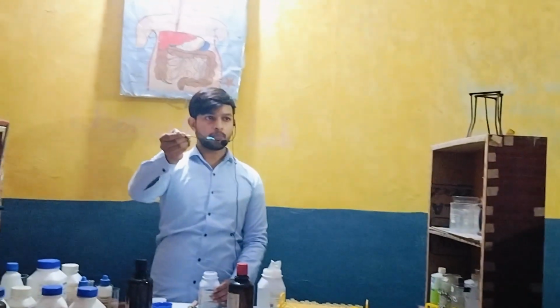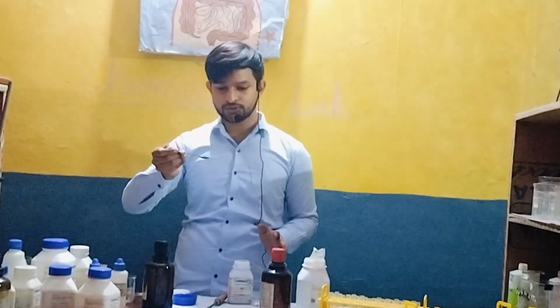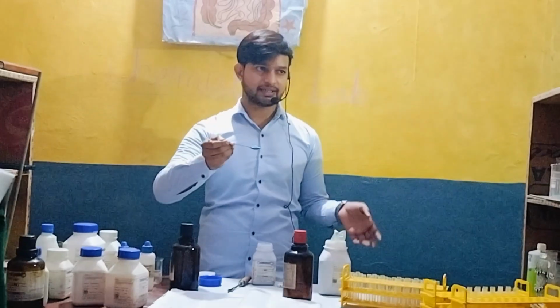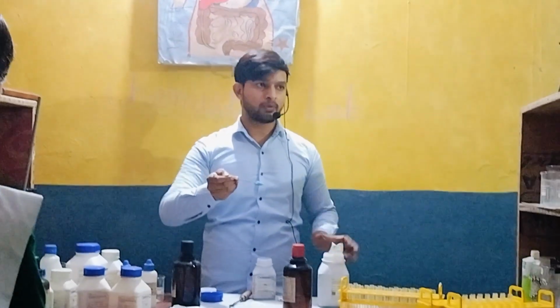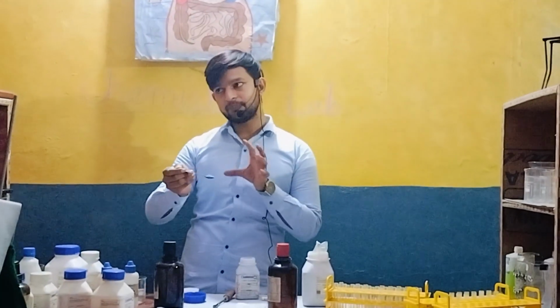This is copper sulfate. Now we are going to do reaction, that is displacement reaction, in which we have taken copper sulfate in the spatula, and the next we will take the zinc. Okay, then what will happen, as zinc is more reactive than copper, zinc will replace copper from its sulfate and the final product will be zinc sulfate and the copper will be separated out.